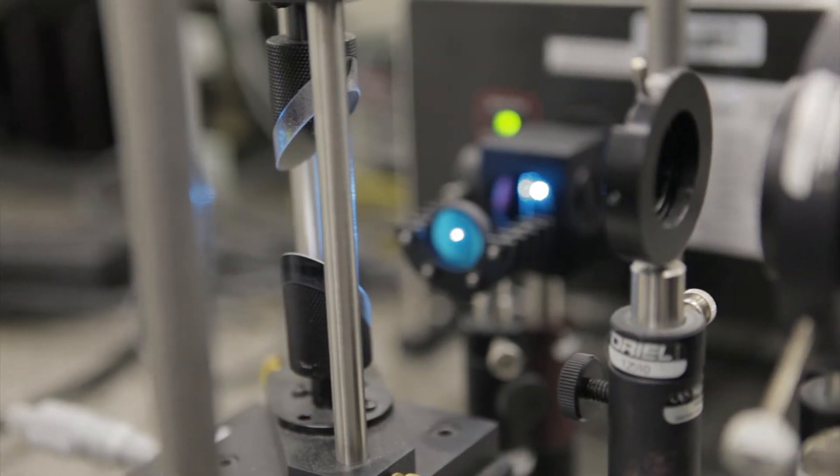So the way we address this problem is with a combination of two technologies. The first technology finds those cells in the circulating blood, distinguishes them from the normal cells, and this is what we call the FAST scanner. The FAST laser can scan 25 million white blood cells in one minute.